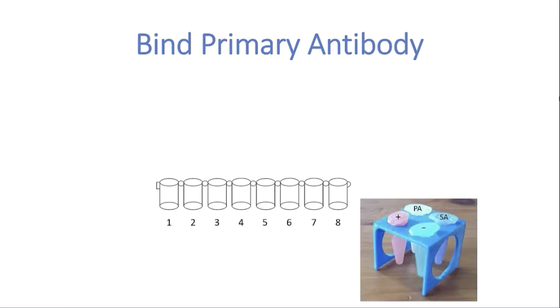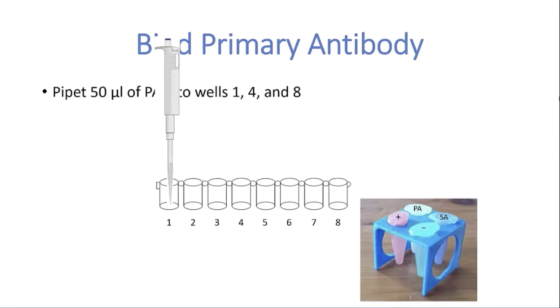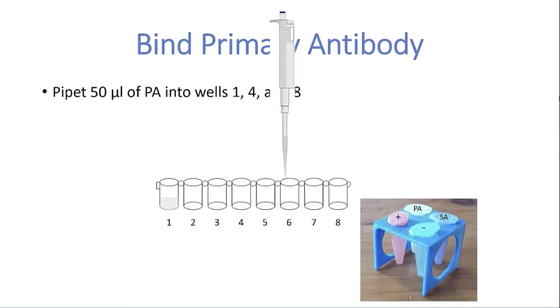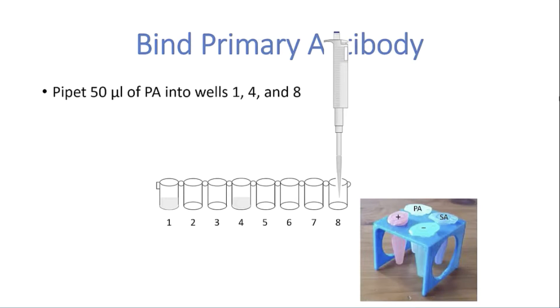In the next step, primary antibody is added to the wells. 50 µL of primary antibody is pipetted into wells number 1, 4, and 8 and allowed to sit for 5 minutes.